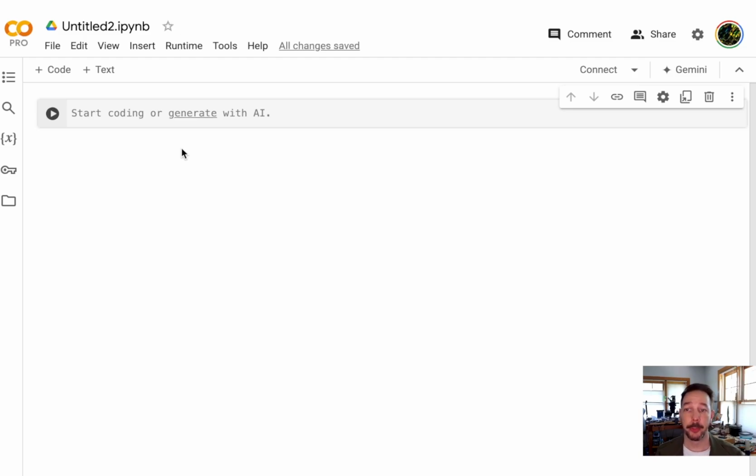Later on, especially if you have a more powerful workstation, it can be better to use Python locally. In that case, you might use Anaconda to create your own environment for a particular analysis program. This is somewhere where you can get stuck, but if it's a good program, they'll tell you exactly what to install to make it work well. So once you have an environment, either in Google Colab or locally, the first thing that you'll need to start doing is importing the packages or tools that you need to use to run the script.